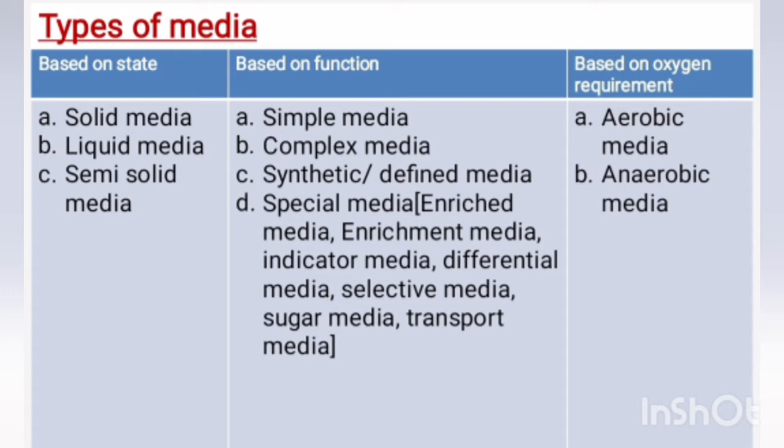Media classification. Media can be classified in many ways. Based on the state, we can classify the media as solid media, liquid media, and semi-solid media. That is one type of classification. Then another type of classification: simple media, complex media, synthetic or defined media, semi-defined media, and special media.